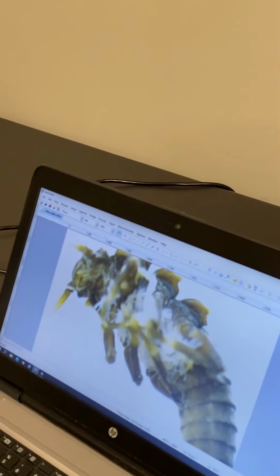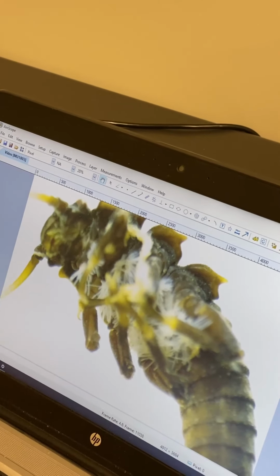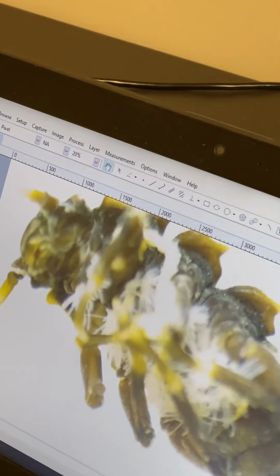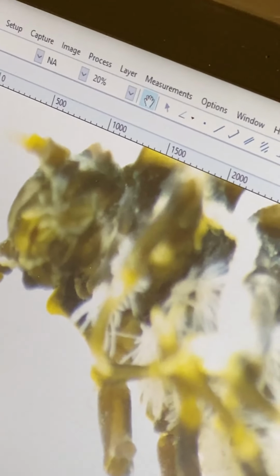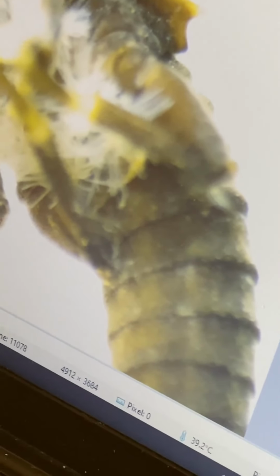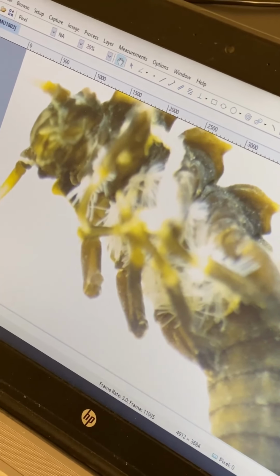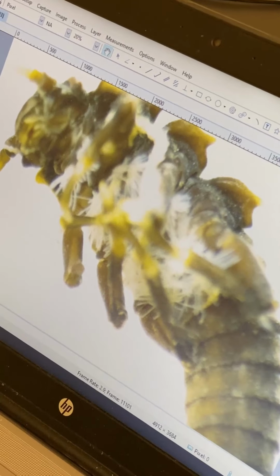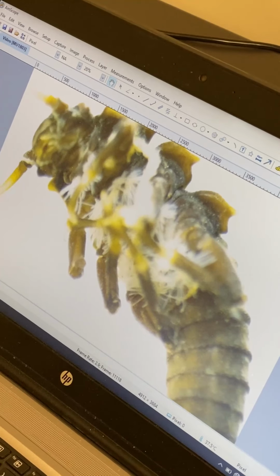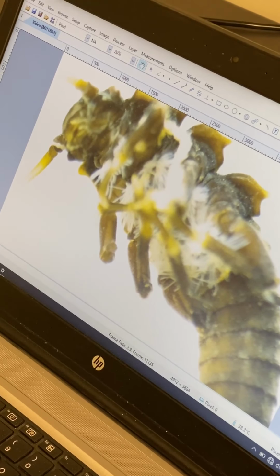This guy right here, it's a little hard to see. Light shining through. He's a type of stonefly, Pteronarcyidae. I always like these guys. These are one of my favorites. When we get these, they're almost prehistoric looking. All these spines and these big gill tufts and stuff, and they can get quite large. Half an inch or so. They're one of the larger stoneflies that we find. But he's one of the Plecopterans, so he's one of the P's that people like to find. We like to see.